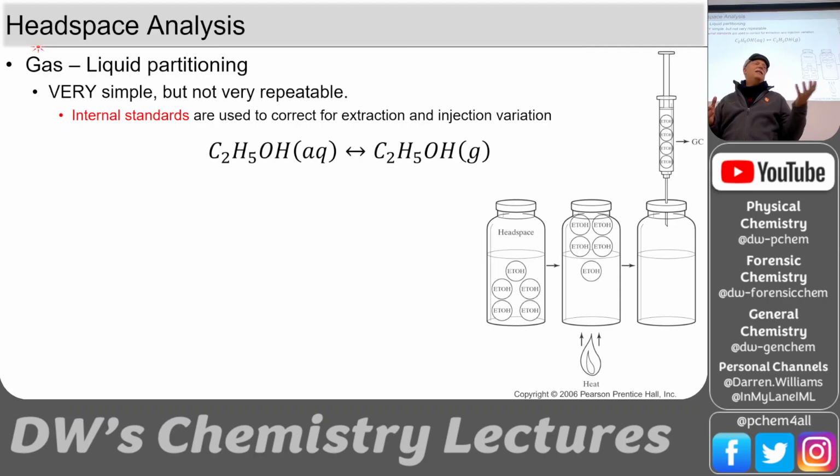Well, these are fatty acids. These are oxidized products of the animal's digestion and so on, and they're all mixed into that solution. How do we get them to go into the gas phase? Well, one drop of acid, like HCl, into that solution protonated all of those fatty acids, and now they don't want to be in water anymore. So they just blow right out of the surface of that liquid, and you can smell them.